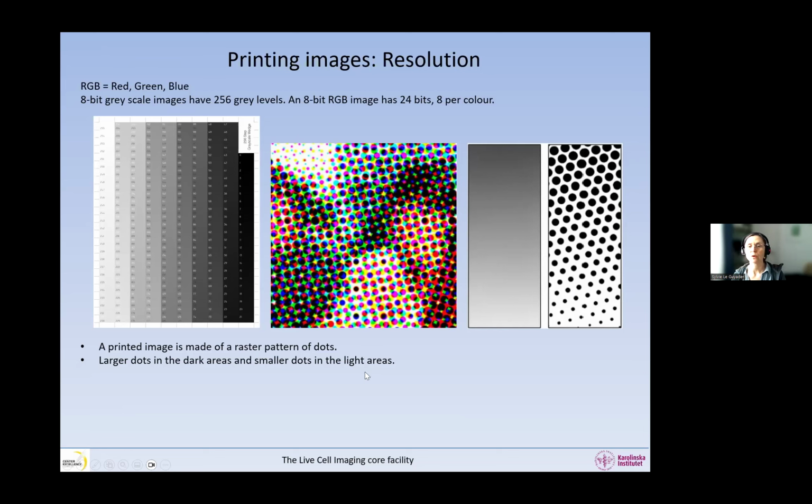Because of the limitation of the printing techniques, it's not possible to print completely black or completely white, but clearly you should not have completely black and completely white if you have no saturation and no underexposure in your images. So that's one more reason why you should not have underexposure and saturation in your images, if you still need to be convinced. If you have some, then this information will also be lost. But anyway, it was wrong to start with, so maybe it's better if it's lost.